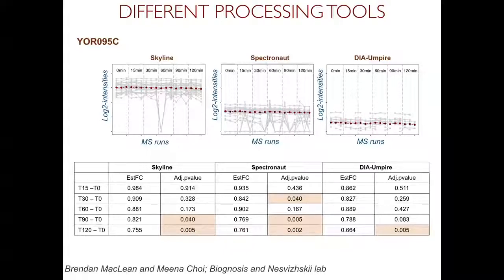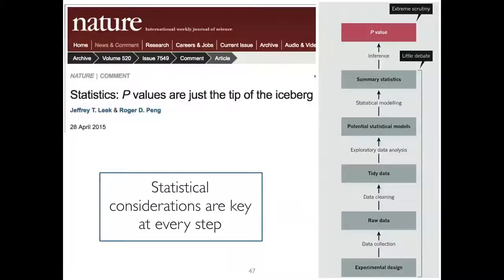So, but you know, there are many things here, right? But in this particular part, the point is that on one hand, we're very excited that MSstats allows us to handle some of this variation. On the other hand, my point is that things before we get to MSstats actually matter as well. So I'm not saying that we just can eliminate all of that. And this is a bigger point, which I really would like to mention generally for statistical analysis.